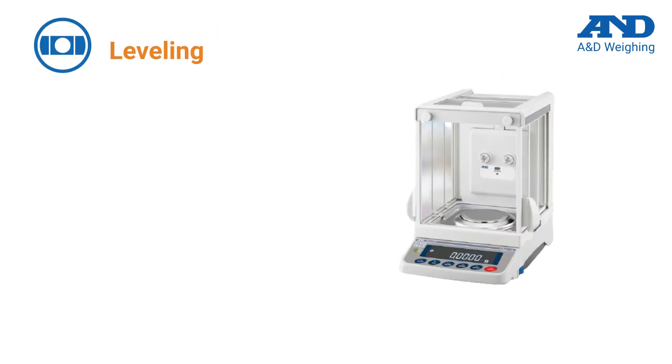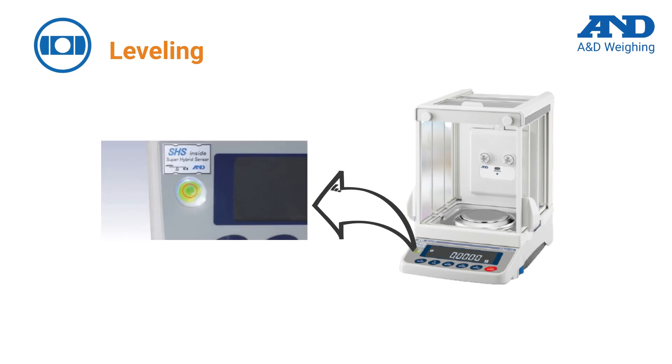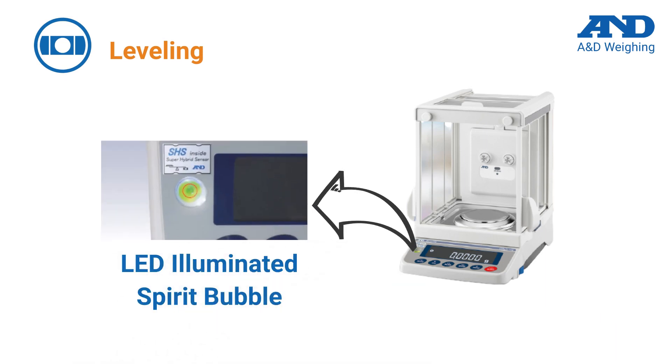The balance must be leveled prior to weighing. Check the level indicator before each use and adjust the leveling feet if needed. Most A&D models offer illuminated spirit bubbles, allowing for easier viewing and setup.